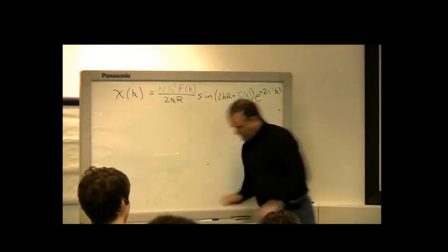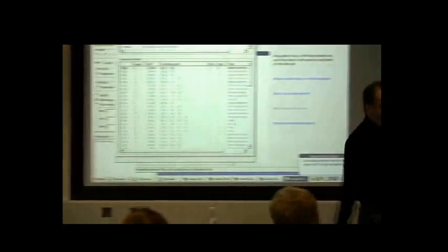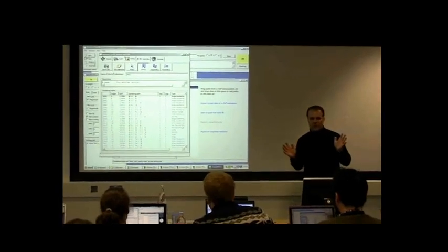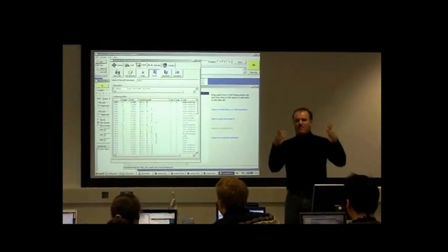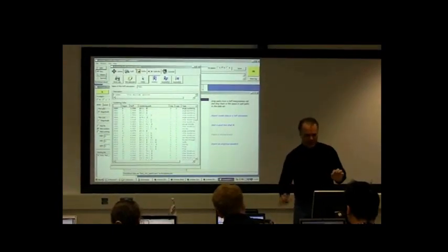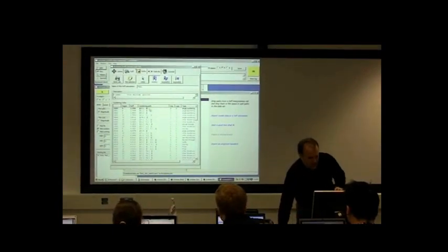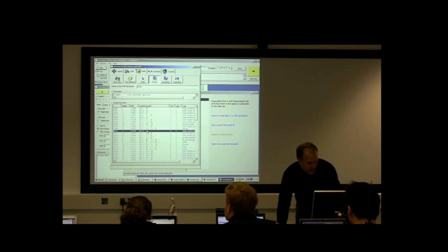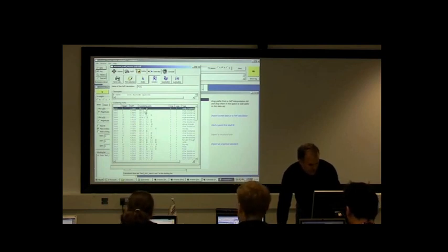All right, so, okay, the next thing I'm going to do is just the mechanics of using the program. Bear with me for a minute. Things will start to make sense shortly. Okay, so I'm going to click on the first one, and then go down and shift-click. Yes, there we go.